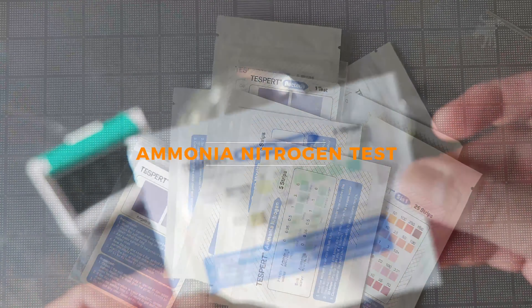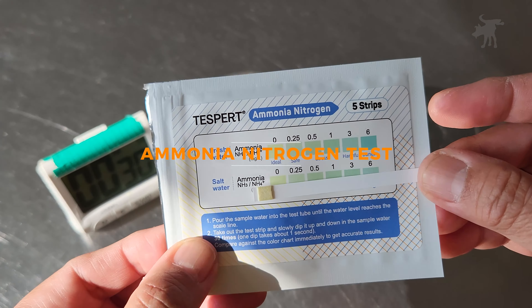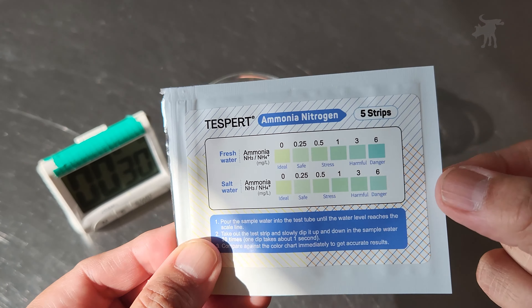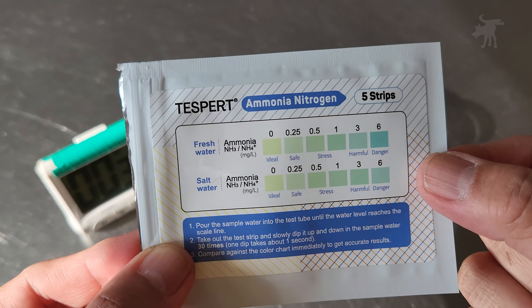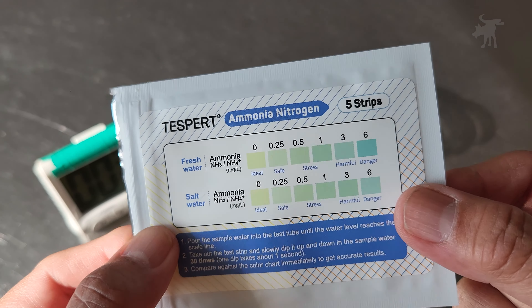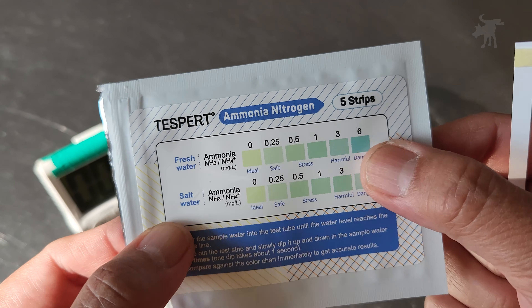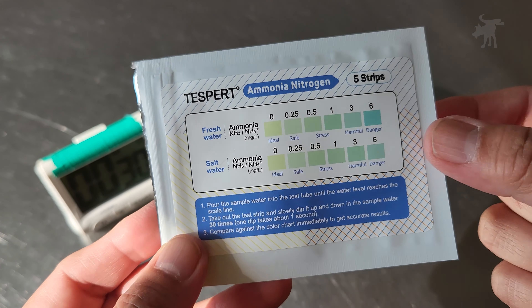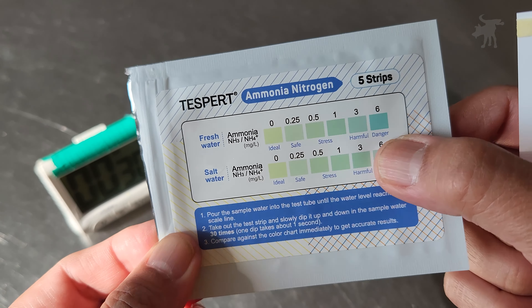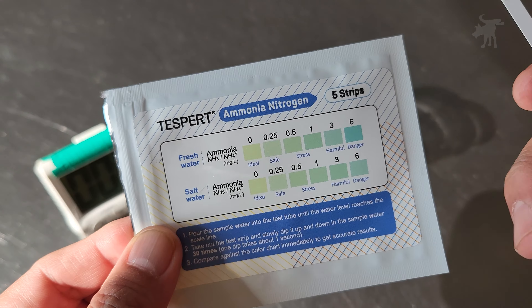Let's start with the ammonia test. We are going to start using our ammonia and nitrogen test strip setup. This was designed, I believe, for aquariums — to test the ammonia level and the nitrogen level and nitrates in the water, because those fish metabolize and live in the water.